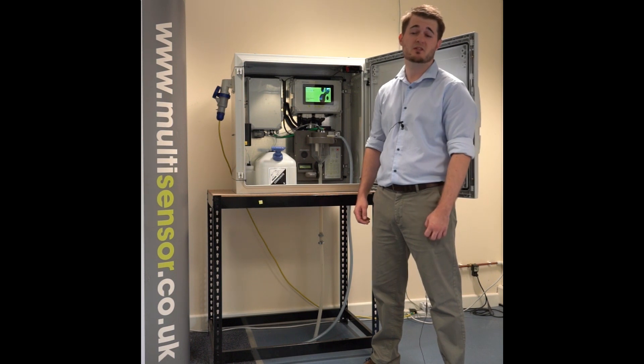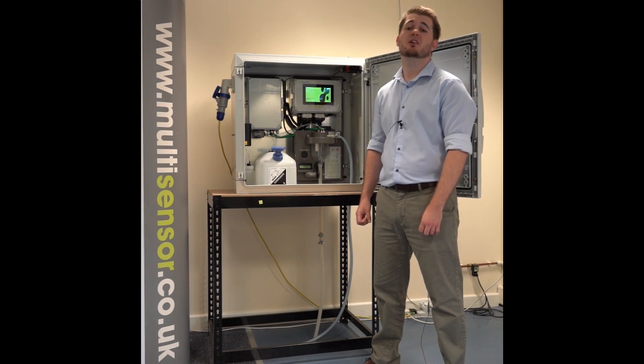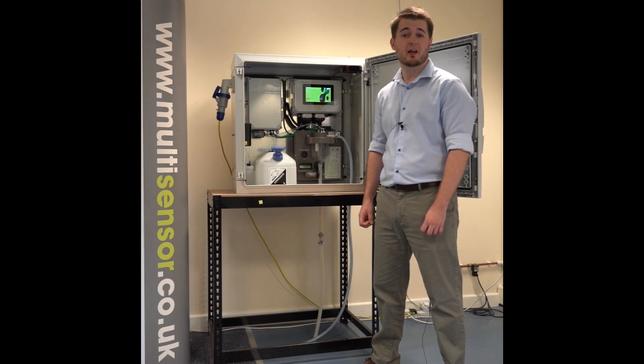This can account for up to 50% of the energy use in their system, providing significant savings. The MS-3500 Ammonium Monitor utilises contactless technology called the electronic nose.